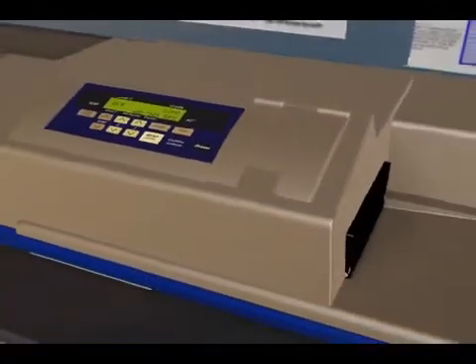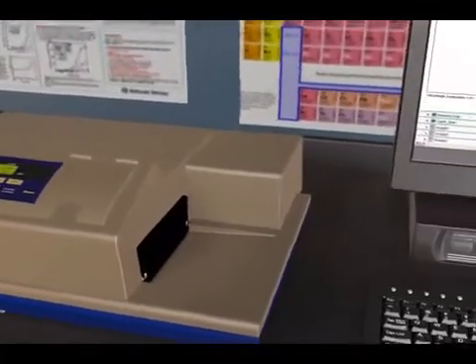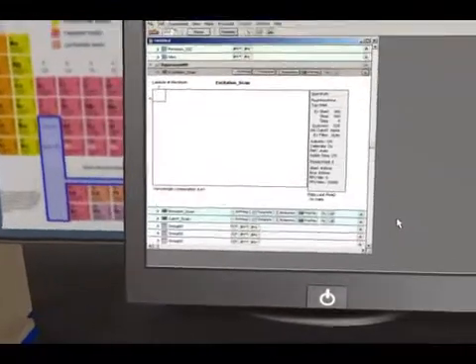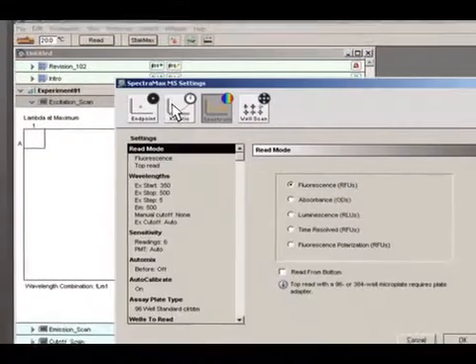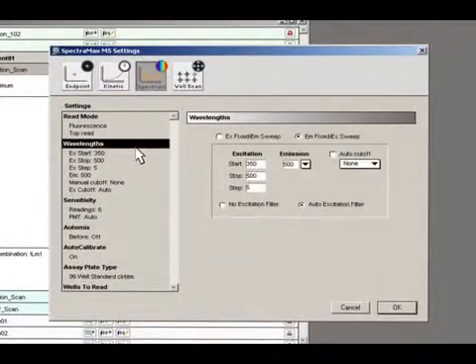The brain of SpectraMax is our market-leading SoftMax Pro software that is powerful but easy to set up and use. Let's optimize the settings for reading a fluorophore. First, we select the wavelength range to scan for the excitation wavelength. We will leave the emission wavelength fixed with a rough estimate.